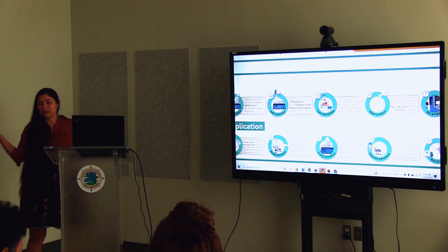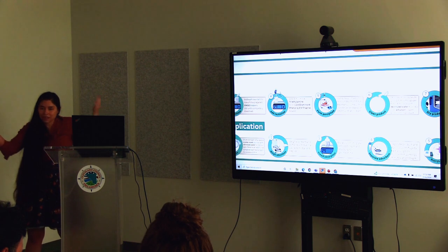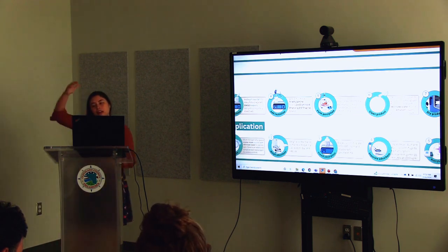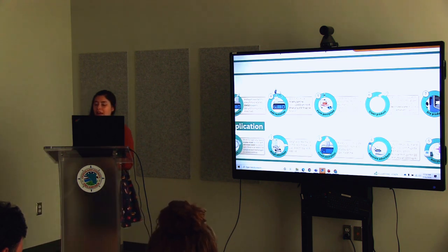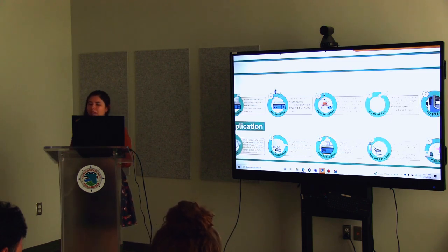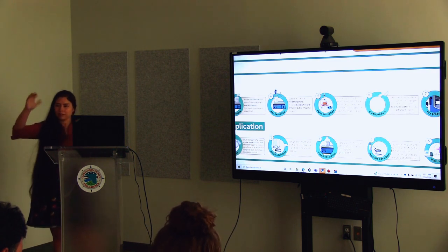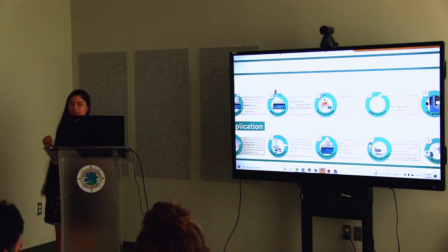But what happens when we heat up liquids? They boil. Yeah, they boil off, and we don't want that. So we also added a condenser to maintain the solution volume so it didn't boil off. And then we are going to clean that product. Basically, we put it through a filter. We have a little filter paper. It looks like a coffee filter, but a fancy lab one.